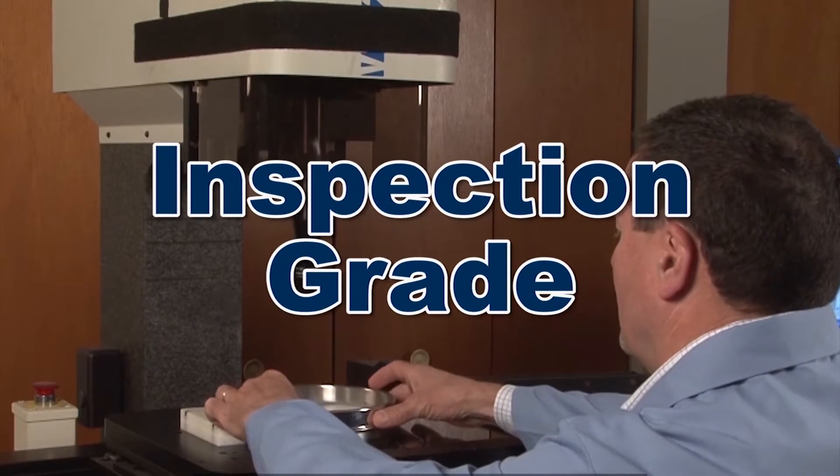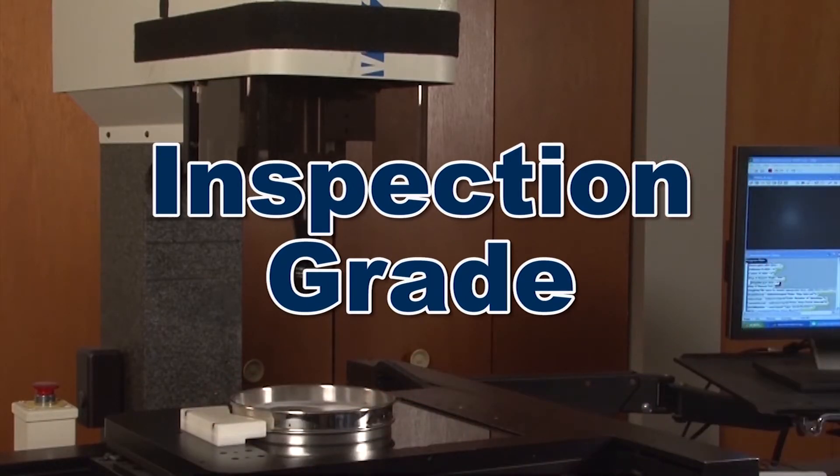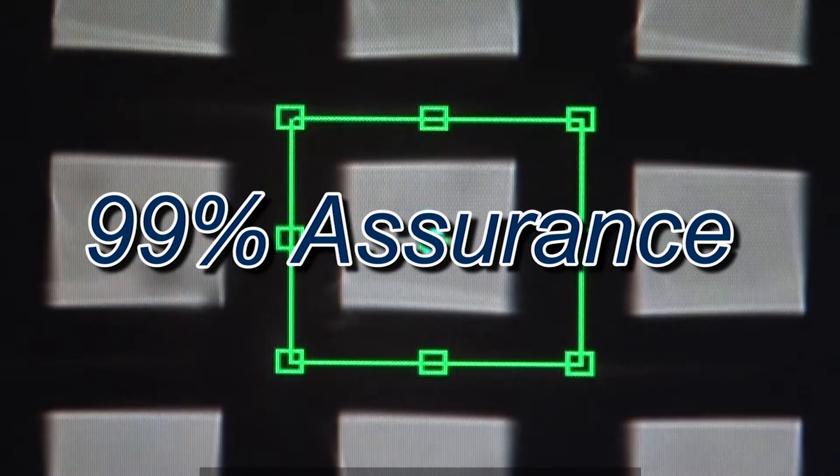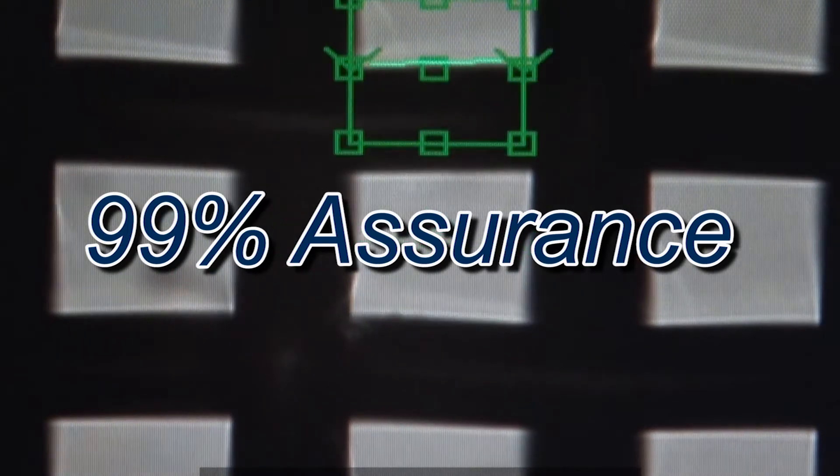Inspection-grade reverification measures a specific number of openings to determine with a 99% assurance that your test sieve or screen tray meets ASTM or ISO standards.